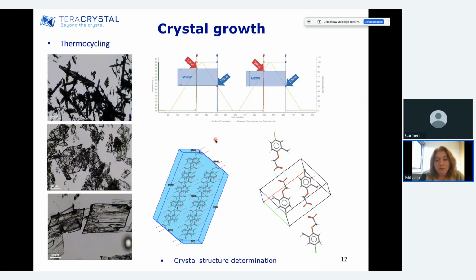But also for this compound, the next step was, okay, we knew that in ethyl acetate heptane, a nice crystallization can be developed, but then we were wondering if we can grow crystals. So you see here was the starting material as was purchased, and then we wanted to have a broader metastable zone width. So for that we chose another solvent system. So it was 2-propanol heptane. And then we saw, yes, the metastable zone width is broader in this case for a certain concentration.